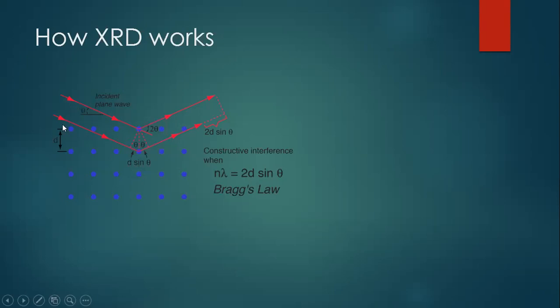And here we can see that there are a lot of dots in this graph, and all of these dots correspond to the building blocks of the crystalline materials. In crystalline materials, the atoms are arranged in a very predictable way. So the incident X-ray beam coming from the X-ray source is scattered at different planes of the material, and this results in diffracted X-rays.